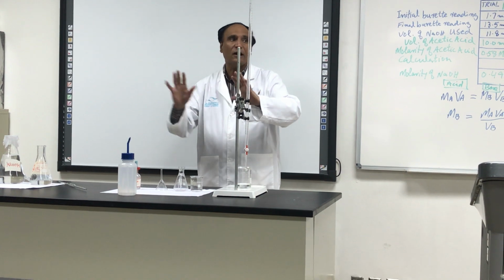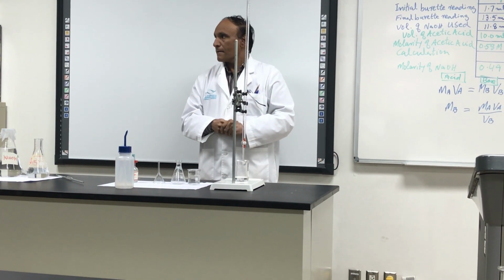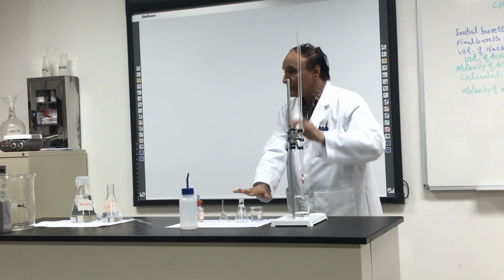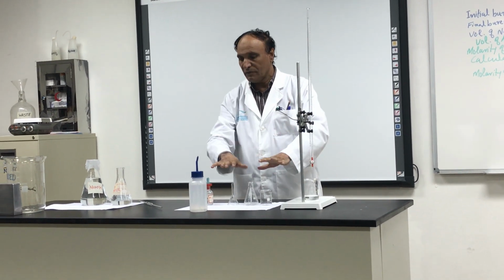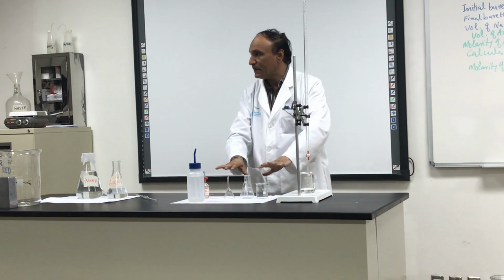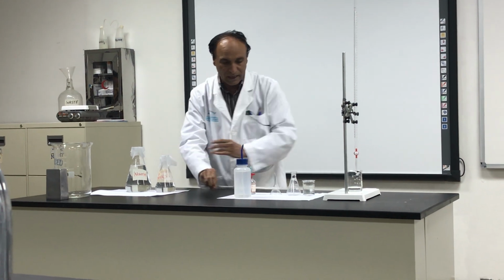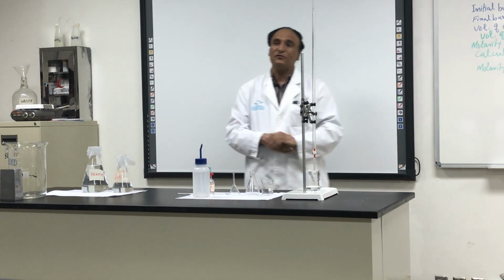And I hope inshallah all of you understood. Wash the burette with the distilled water, as I showed you, and the other things with the tap water. And leave it over here. All the things will be ready for the next group. In this way we do the experiment.